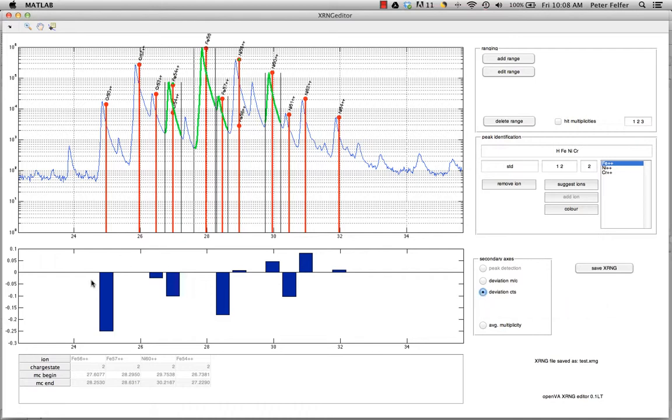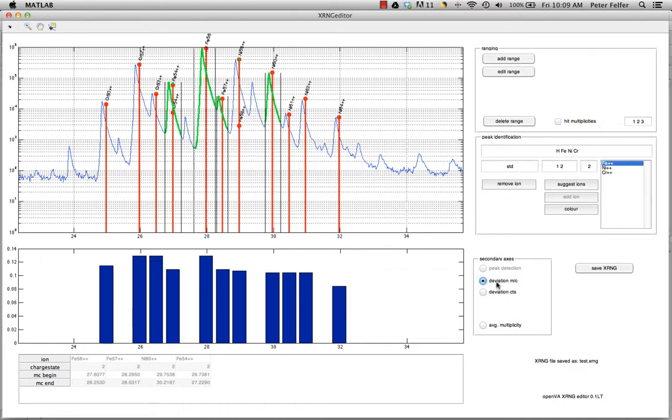And there are some considerable deviations here in some of the smaller peaks. It's mainly because there are overlaps, like the iron 57 peak, for example, has a good 20% overlap with the iron 56 peak. Because they're both iron, it doesn't actually matter all that much. Other peaks, it's sometimes a little bit more problematic. For example, here we've got a mixed peak. We've got an iron and chromium mixed peak that's about 10% overlapping. And average hit multiplicity obviously only works if you've got EPOS files. But anyway, so that's recalibrations that are available here.